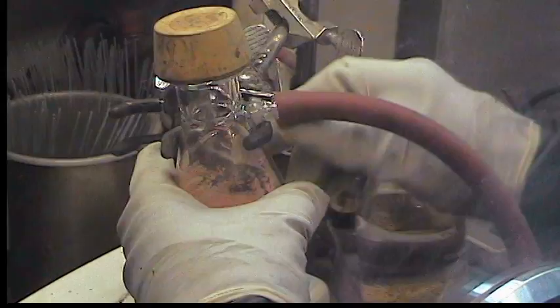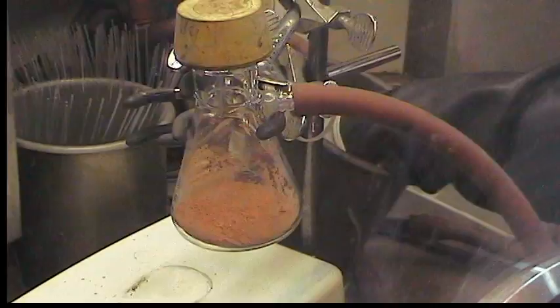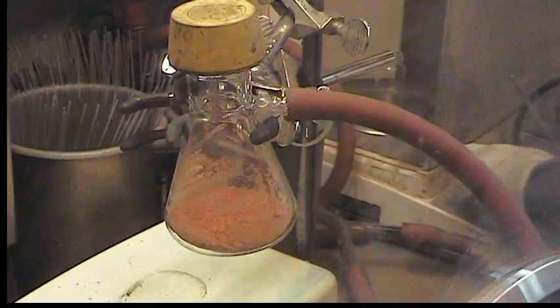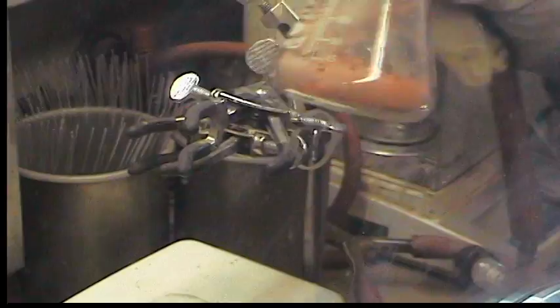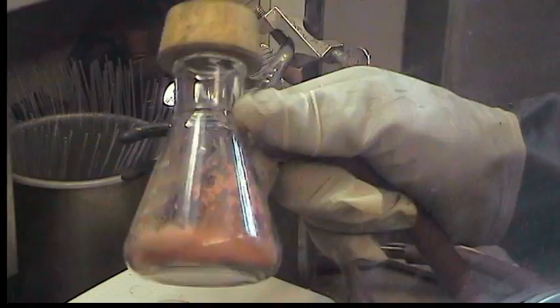So that powder looks nice and light orange now. And we have exactly one vial left. I'll usually pump on it for a few minutes, but we'll just weigh it out and then pump on the vial.